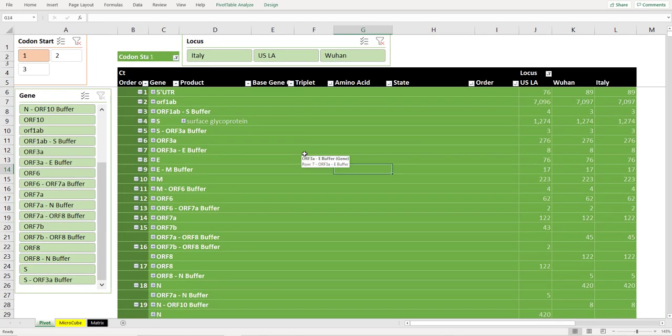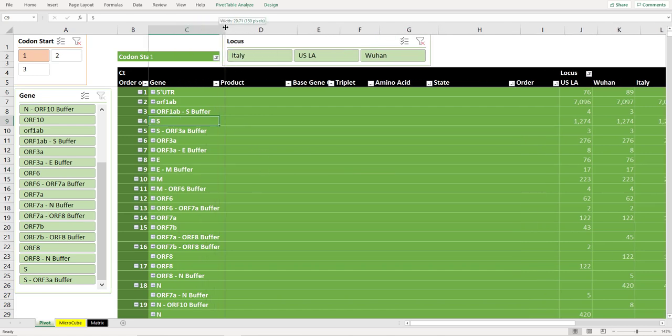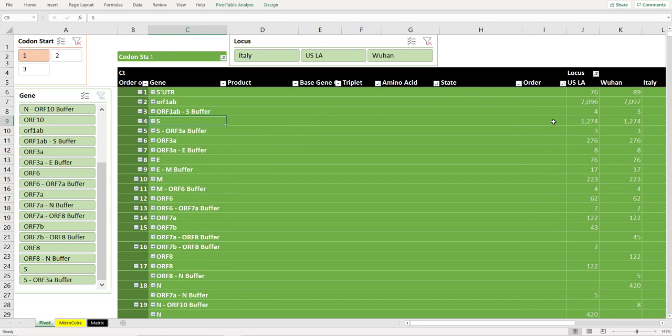So that's the tool. If you're interested in using this, or you want to learn more about it or get involved with this process, I think it's beneficial for everybody for us to really understand what's going on at the molecular level, and then we can try to combat it. We can build tailored vaccines, we can build tailored treatment plans. It all gets down to this base level of analysis, this granular level of what's going on. It's science, and we can get there, so we'll work toward it every day.